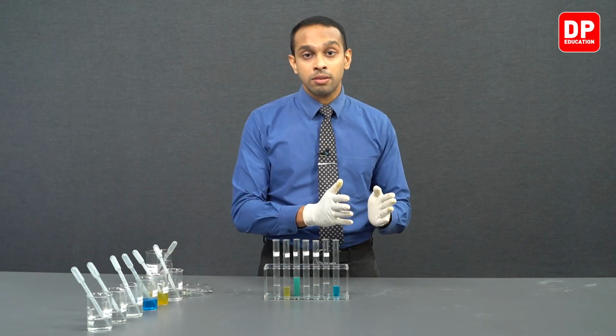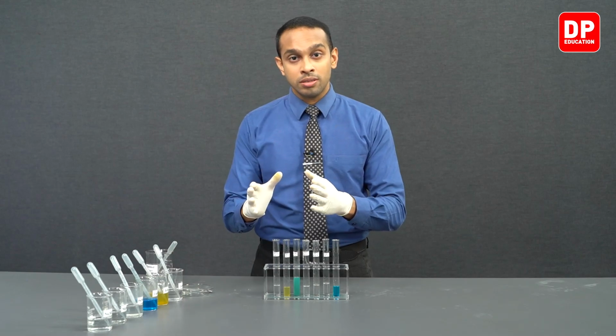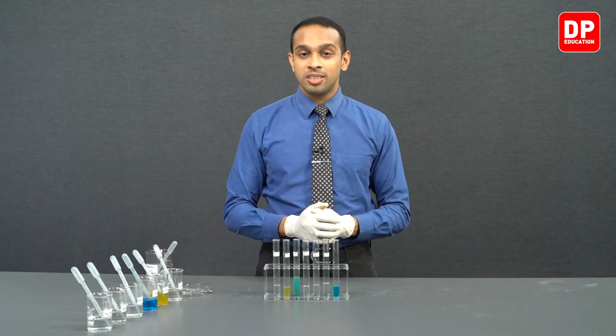So you will observe the brown color copper solid formed at the bottom of the test tube. So students, what about the color of the copper sulfate solution? Why did the color decrease? Because when it comes to copper sulfate, the blue color in the copper sulfate solution is there because of the complex copper 2 plus ions formed with water ligands.